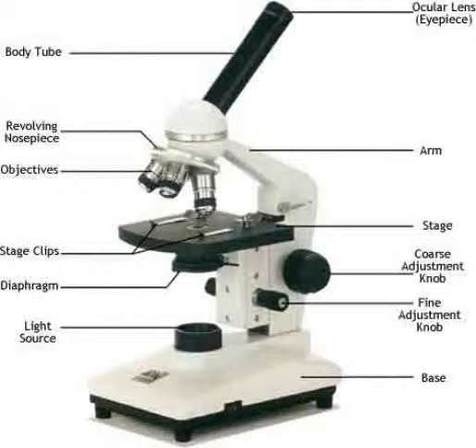Rotate the high power objective in place. Observe the thread carefully as you slowly open and close the diaphragm. Microscopic measurement. Number 1. You will now measure the diameters of the low and high power fields. This will enable you to estimate the actual size of the specimens you will observe later.